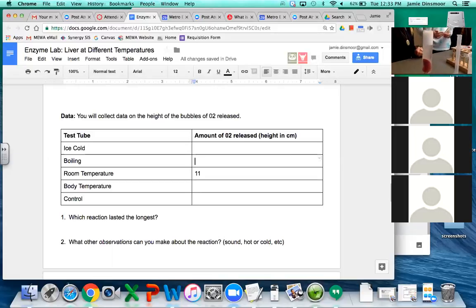More or less than last time? Less. Much less. Right? A nice controlled bubble. We're not scared that it's coming out of the tube. Hold on, give it a couple more seconds. Looks like it's rising up a little bit more.